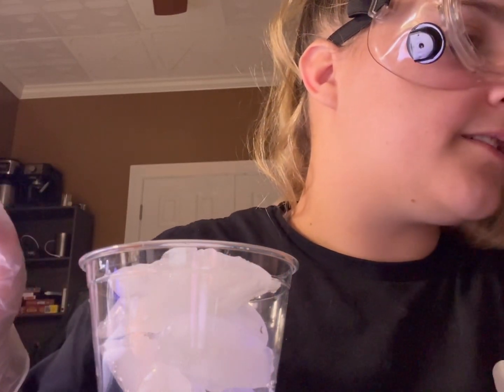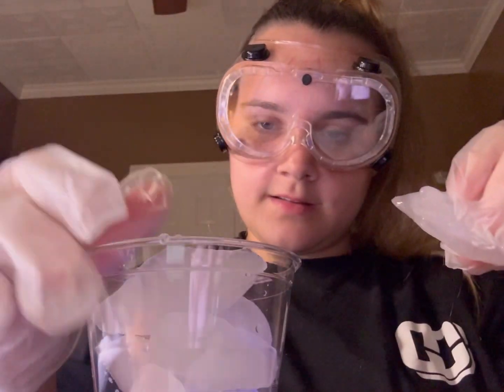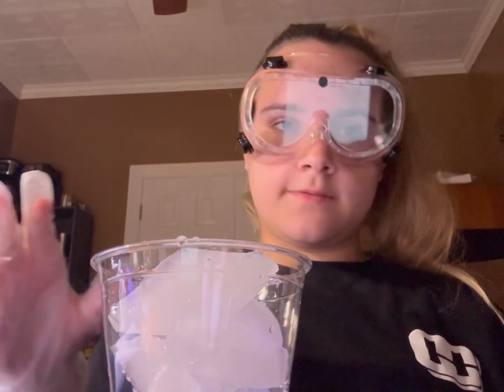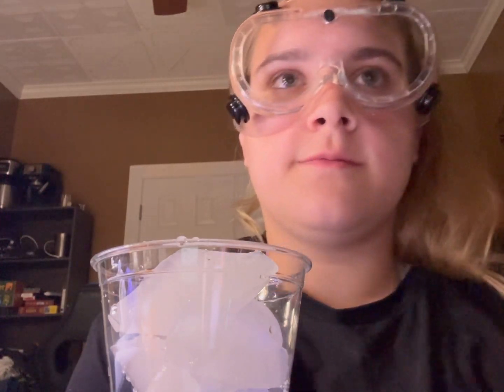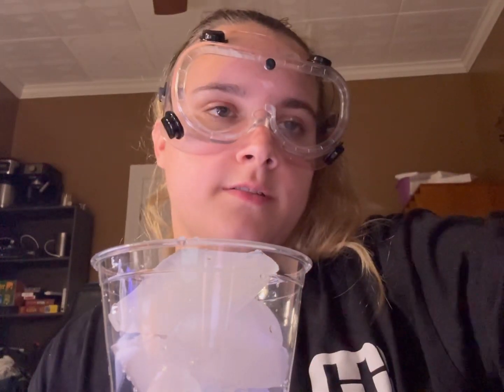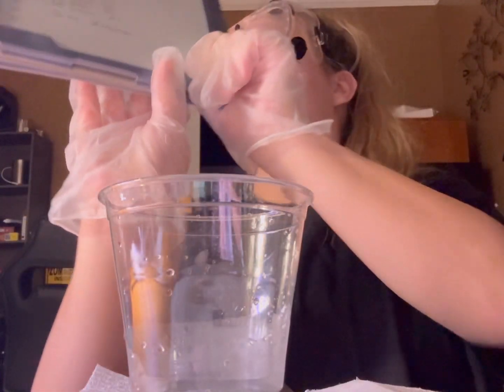Let's find a tinier ice to replace one of these. It's 103, which is enough. So now I add 25 milliliters of water, and I will record every 30 seconds what the temperature is. So I'll show y'all the results. So here are my results from the tap water.